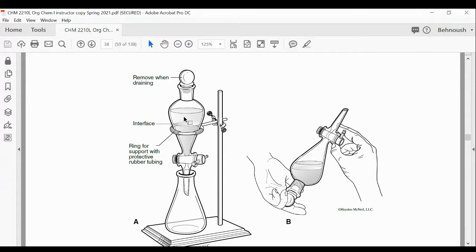So to remove that single product from the mixture that you have at the end of the reaction, you basically extract that compound out of the impurities, leftover reactants, the byproducts. If you have two products, minor product, major product, you want only one product. So you take only one product and you extract it into a proper solvent, which we are going to talk about. What is a proper solvent here?